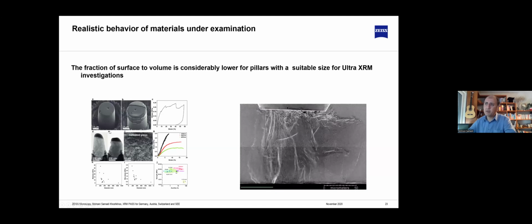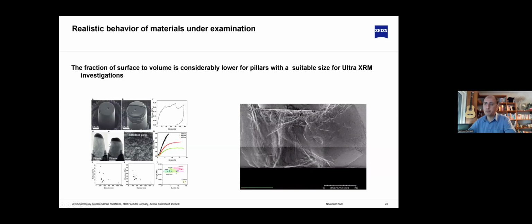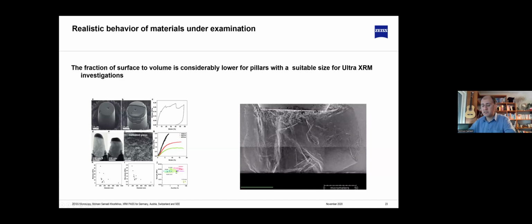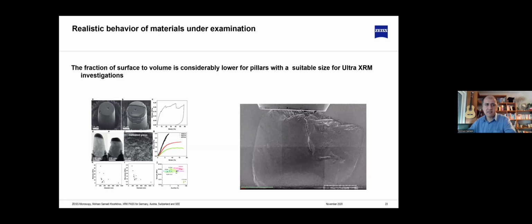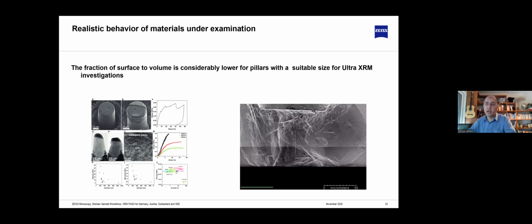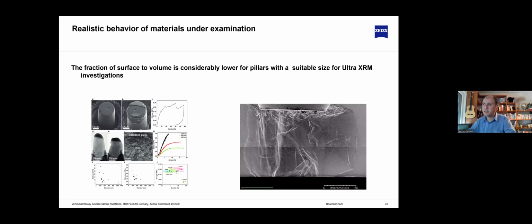If you have a look here, sometimes the size of the nanopillars for high resolution TEM investigations is getting down to 200 nanometers. Perhaps if atomistic resolution is needed, of course, that's the size of the pillar, because other than that, it's not possible to achieve high resolution TEM images if the pillars are larger than a certain level.